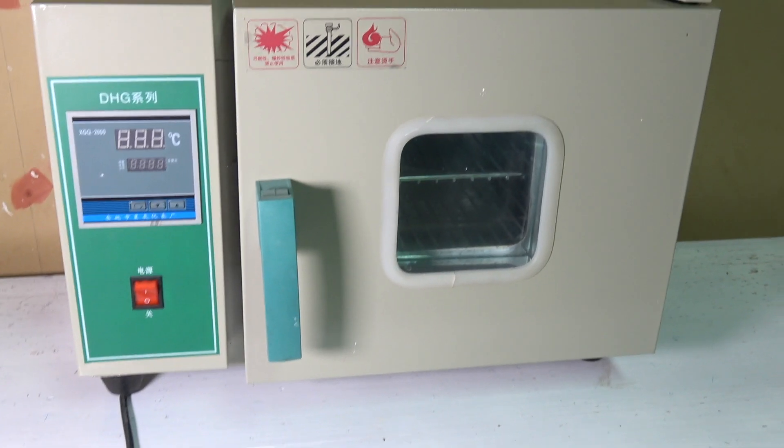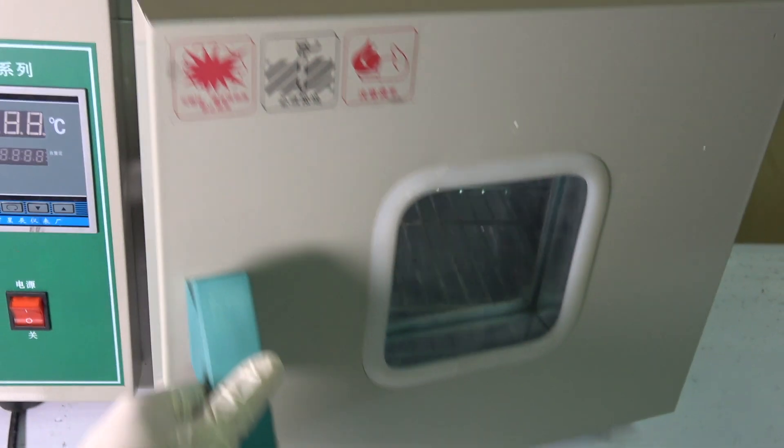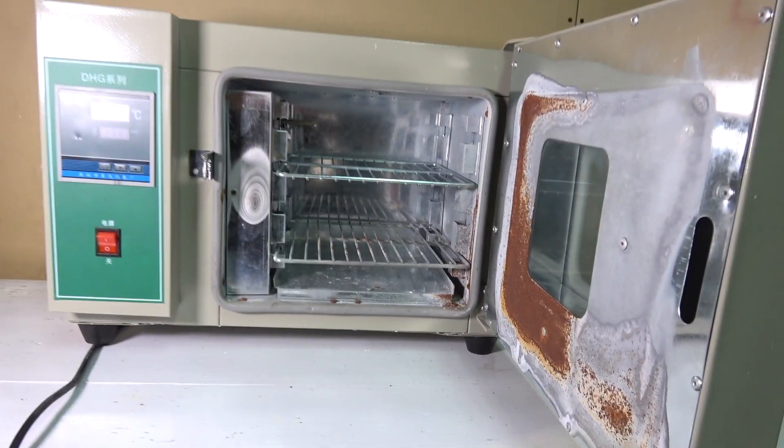Hey guys, if you aren't new to this channel, you may have seen this lab oven open in many of my previous videos and know that I have it for a while. And let's be honest and say the relationship I had with it was rather overusive.